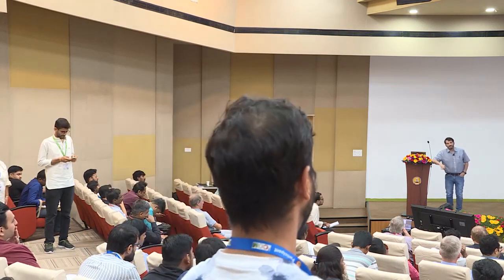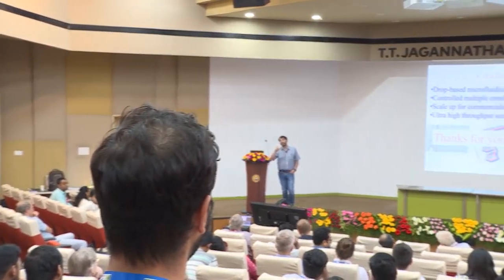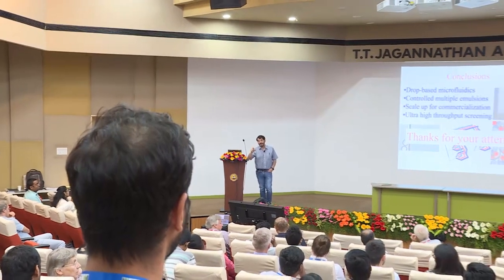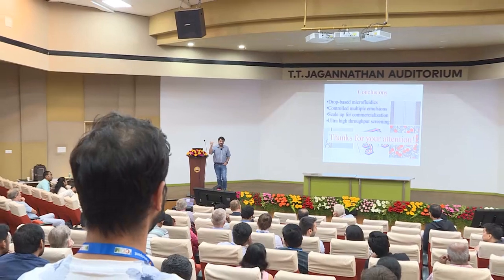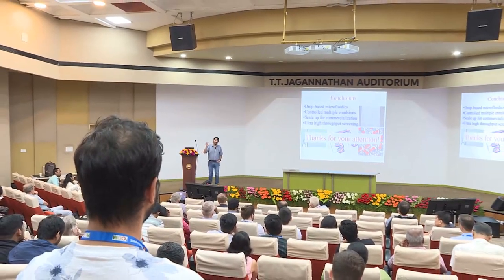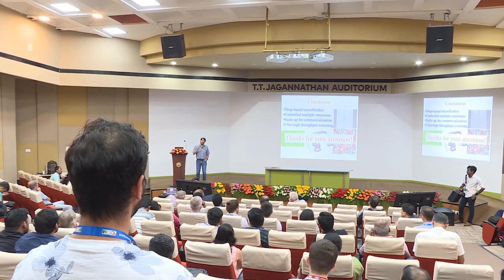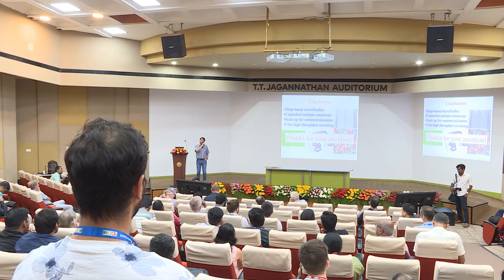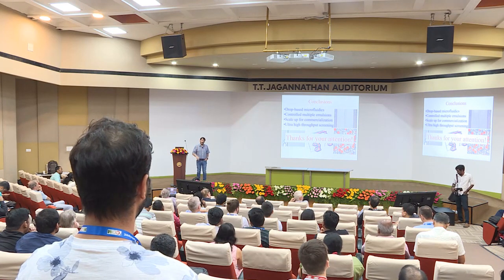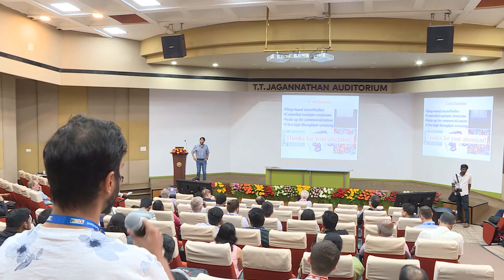Again, we've done that more for having a responsive material for controlled release, for the materials property, to put transfection and things like that. That we're interested in, but that's much more along the lines of what we're working on for drug delivery. So we'll make the materials with the microfluidics and use that to transfect cells, for example. We do a lot of work on that.